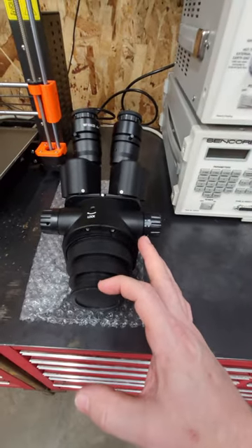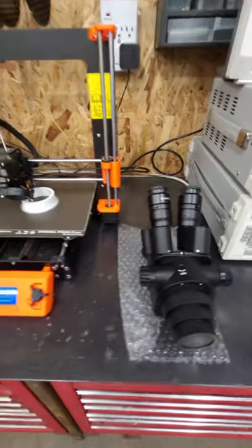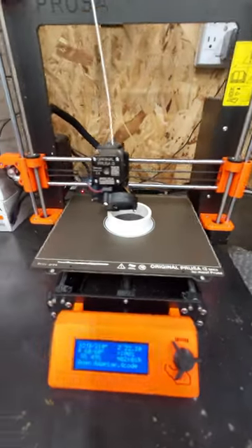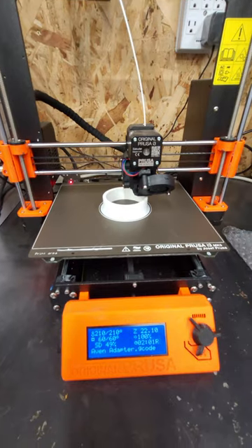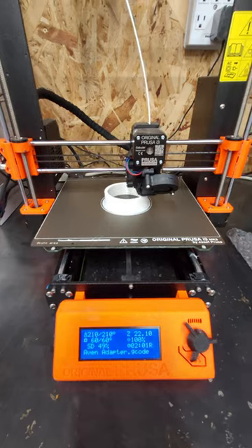The working distance with a 0.5x Barlow lens is acceptable. The overall length of it is shorter, so to get it to my working height I need to print an adapter, which I'm doing right now.